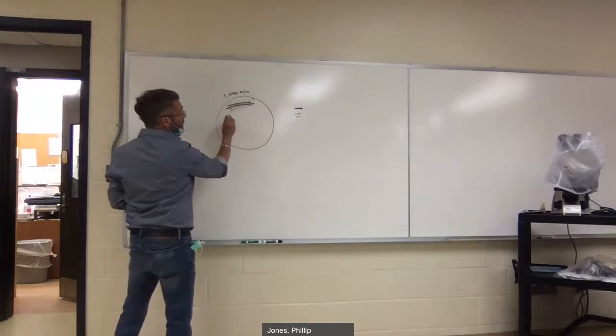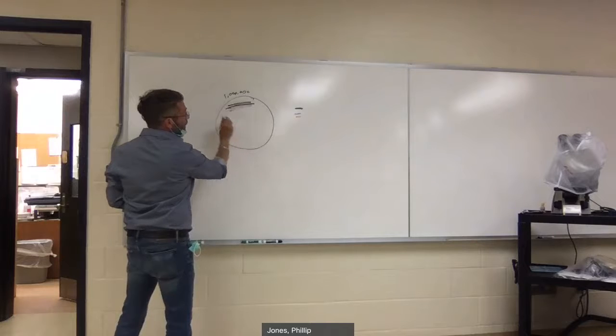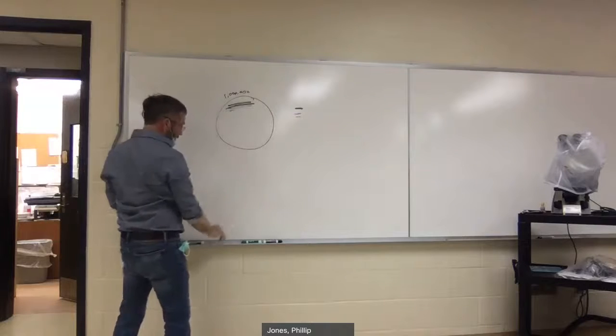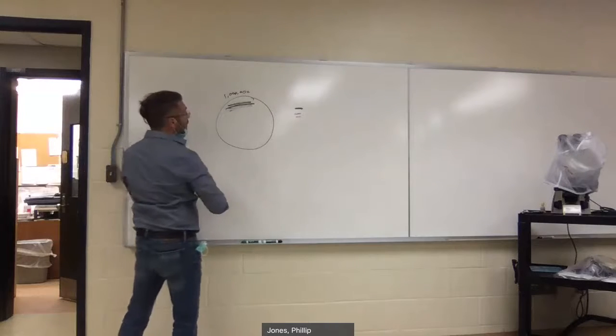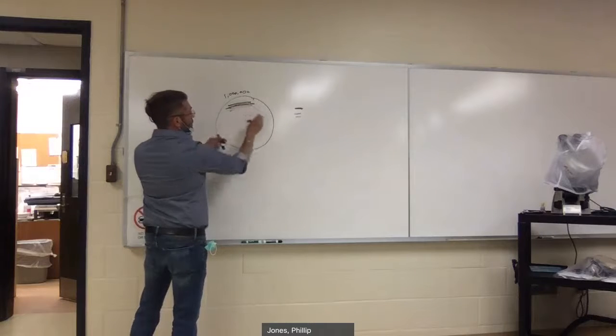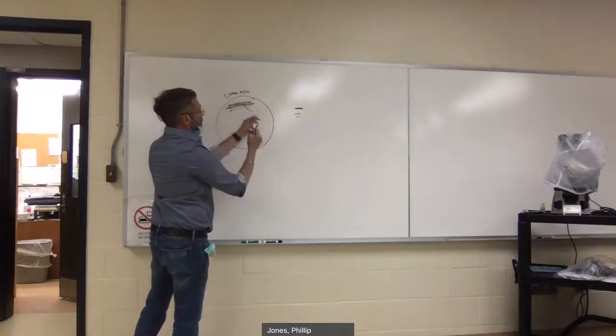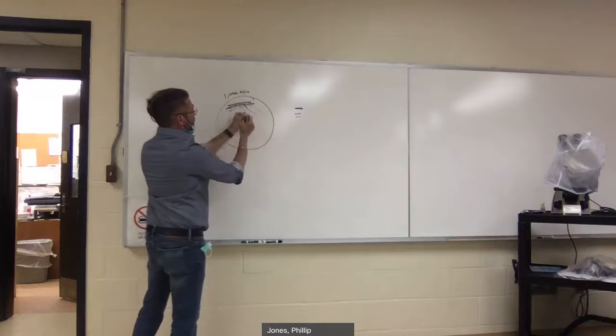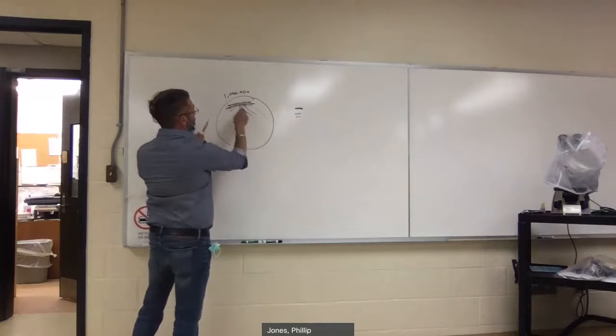Then I want to grab my plate and I want to make like 3 streaks here. So I sterilize it, then I'm going to streak it out here. This is really sloppy, but get the idea.